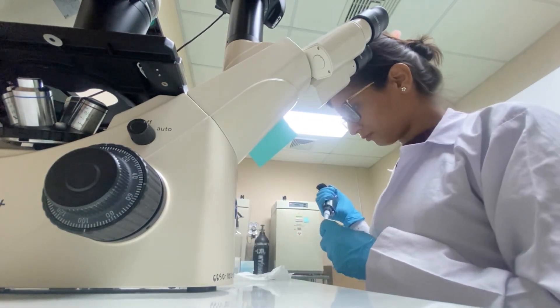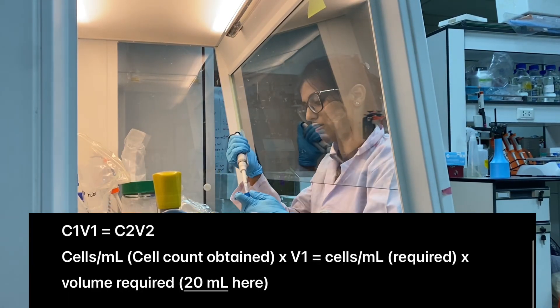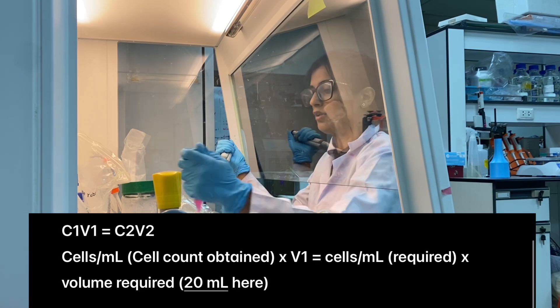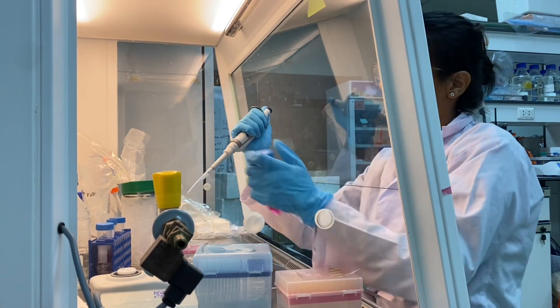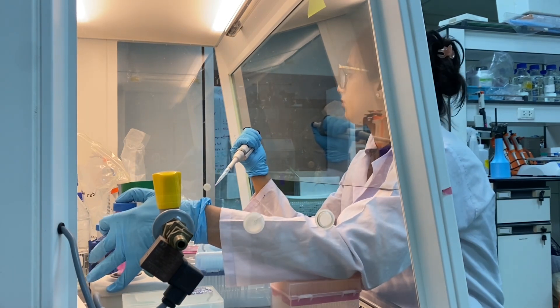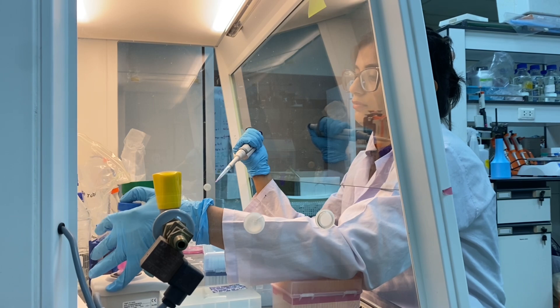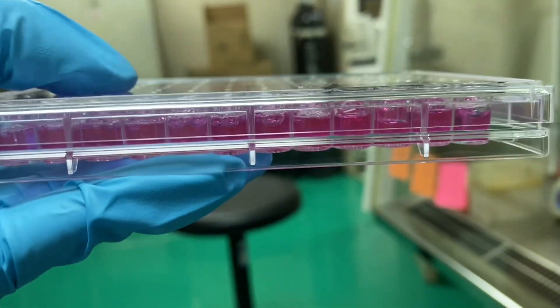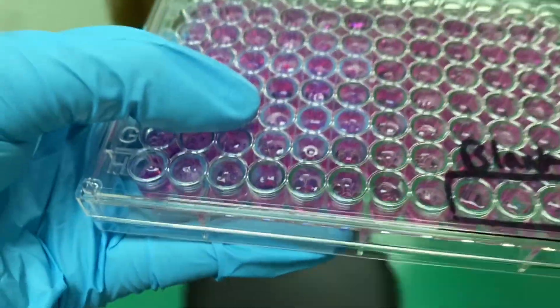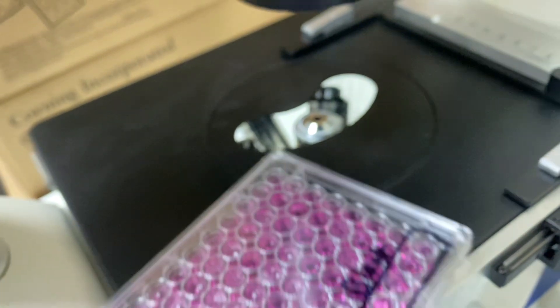After doing the cell count, I'll be able to do my calculation for the volume required for seeding. I'll put that volume into 20 ml of full media and then seed 200 microliters into each well. This is my plate — I've seeded 200 microliters per well and I also have some blank wells.